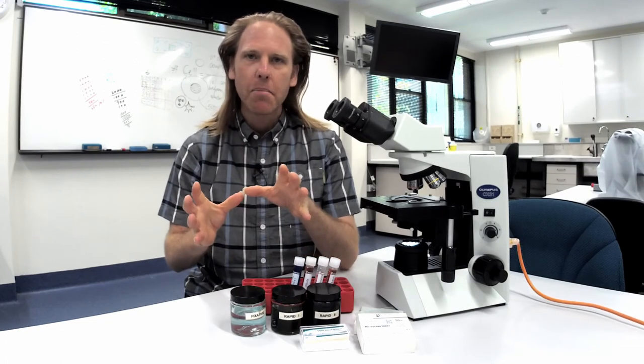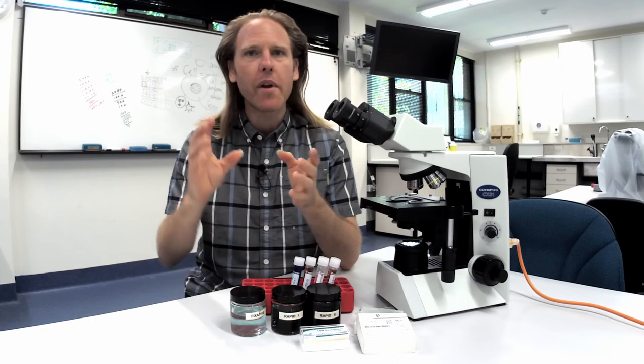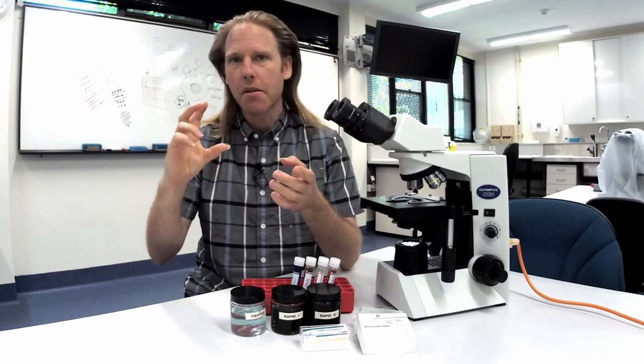With fluid samples make some smears in house and submit those along with some fluid in EDTA and some fluid in a plain tube.